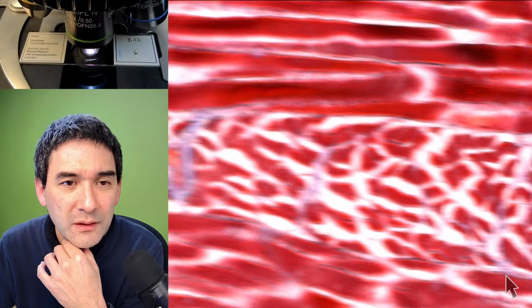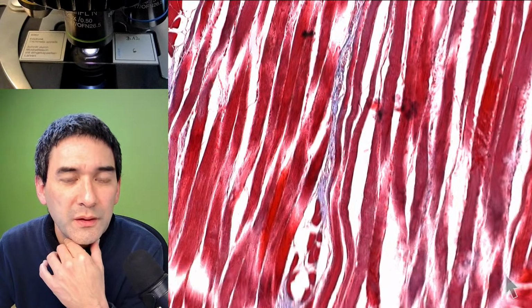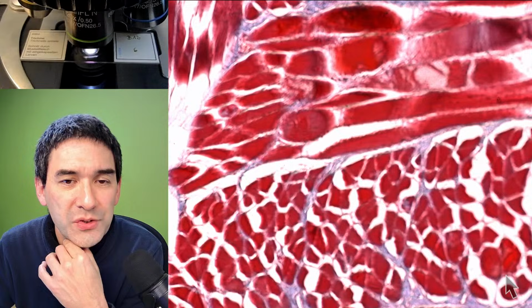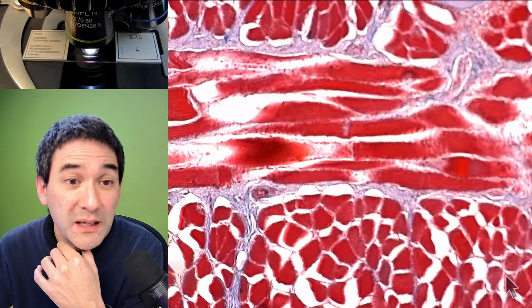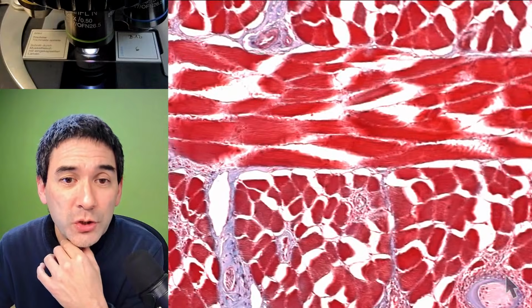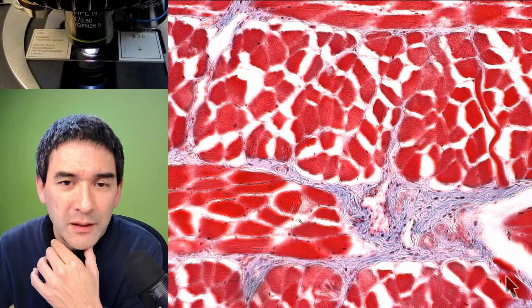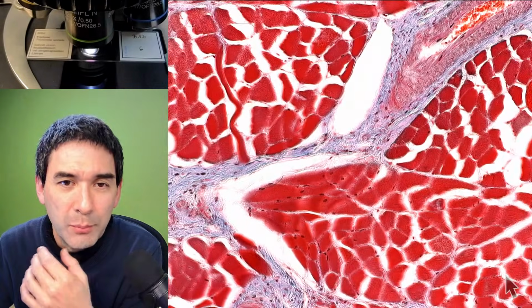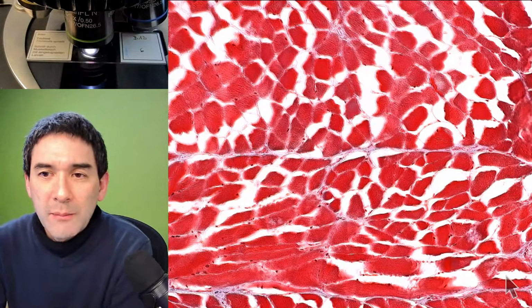In any case, that is a nice sample of muscle tissue with a couple of those trichinella nematodes, worms, which are basically parasites. That's why you should always cook pork quite well, but to my knowledge, all of this pork is tested these days, so it shouldn't be a problem. So I'm going to do the following.